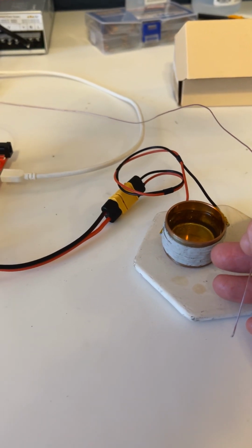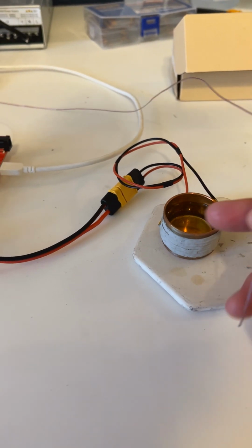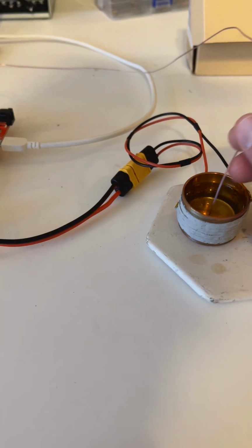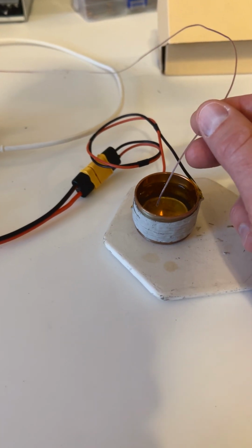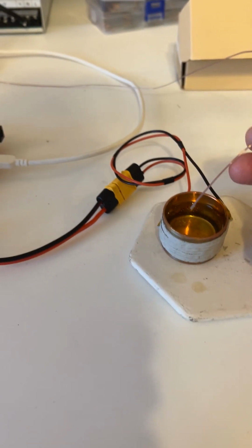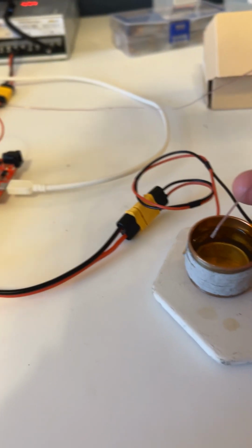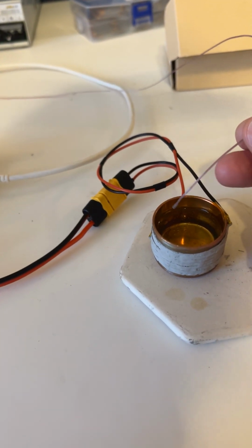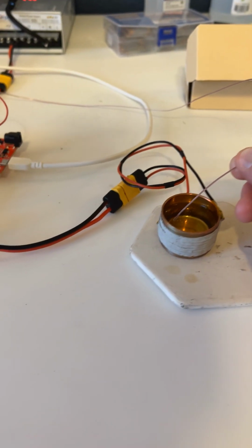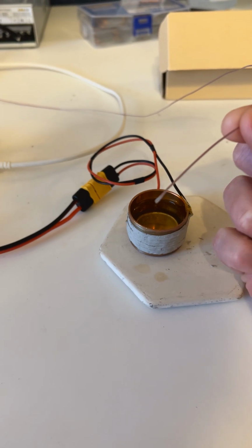But even with that high electrical resistance, it's in the megaohms, it still can allow some voltage to present itself inside the liquid. Even with distilled water, and the cryoprotectants would certainly not be as pure as distilled water, it still messes with the tip of the thermocouple.